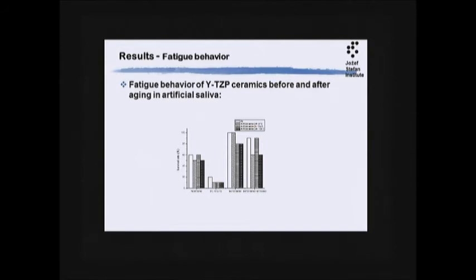But you'll see here, none of the sandblasted specimens failed when tested in air. None when just exposed to water overnight or for 24 hours, a slight drop after autoclaving, and a lot of scatter in values for the sandblasted plus annealed material. But the values will be somewhere between this control group and the sandblasted group.